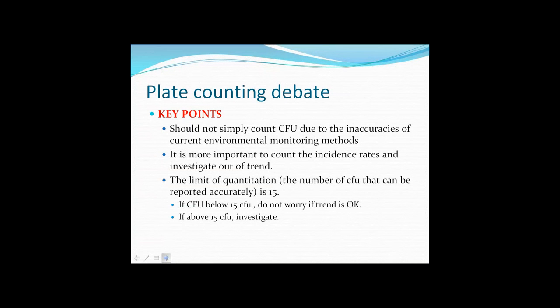But it's also important to emphasise here we do have disagreement with EU GMP over this idea of numerical values. So one of the dangers is it could be assumed, from too literal a reading of the USP chapter, that if a plate has a count of up to 14 in the aseptic manufacturing area, it's okay, and if it's 15 and above, it's a problem, and that would stand against EU GMP Annex 1, inferring that a count of 1 is something that's reacted upon.